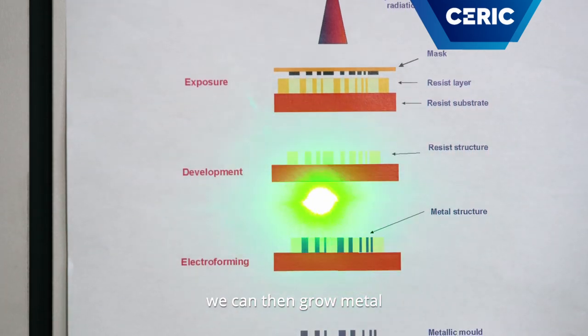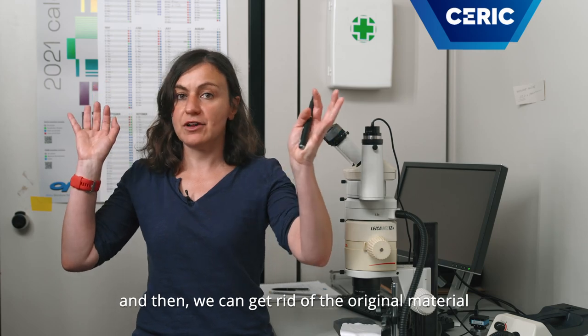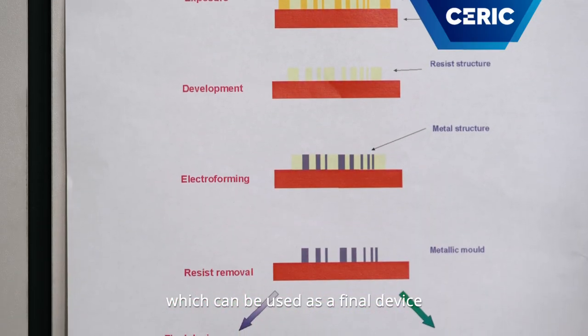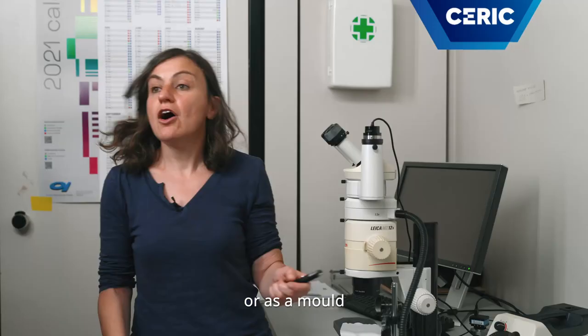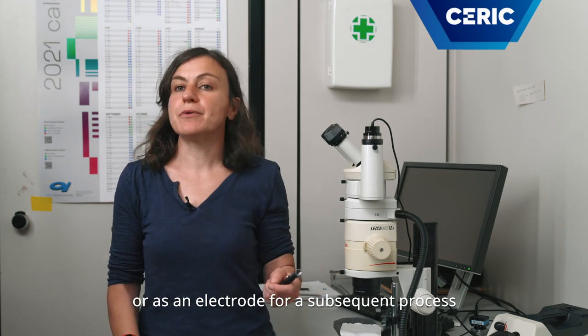we do the irradiation, the development. We can then grow metal inside the holes of our material. And then we can get rid of the original material and we can have a metallic object. This can be used as a vinyl device, or as a mold, or as an electrode for a subsequent process.